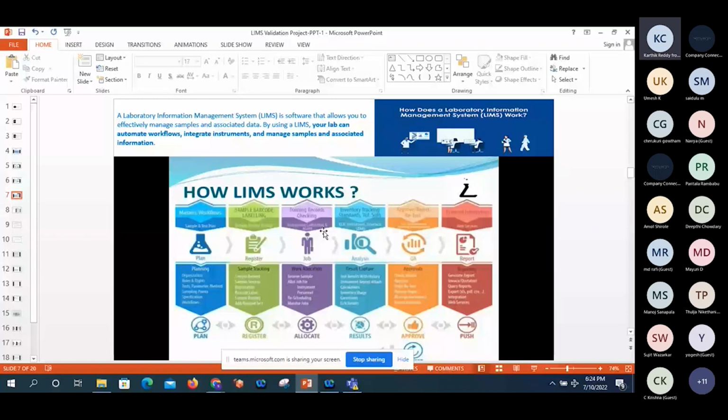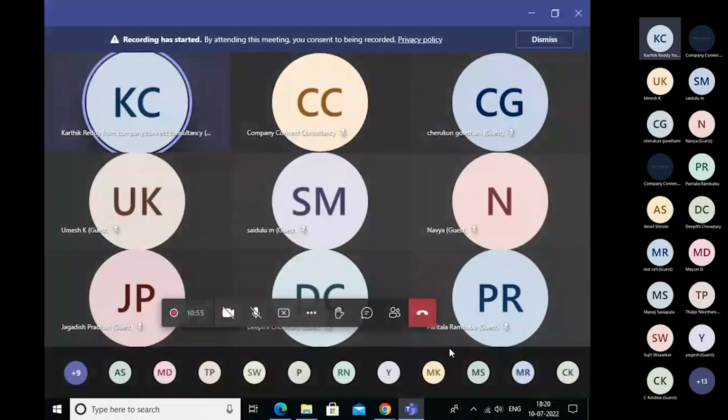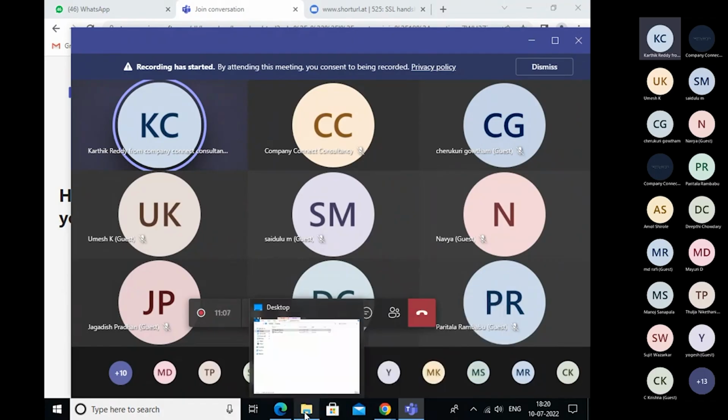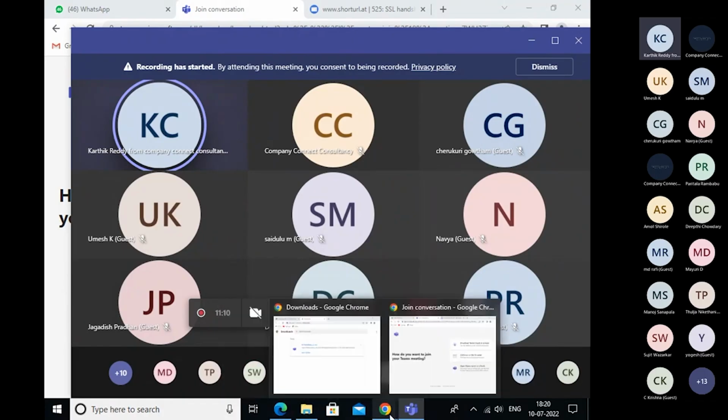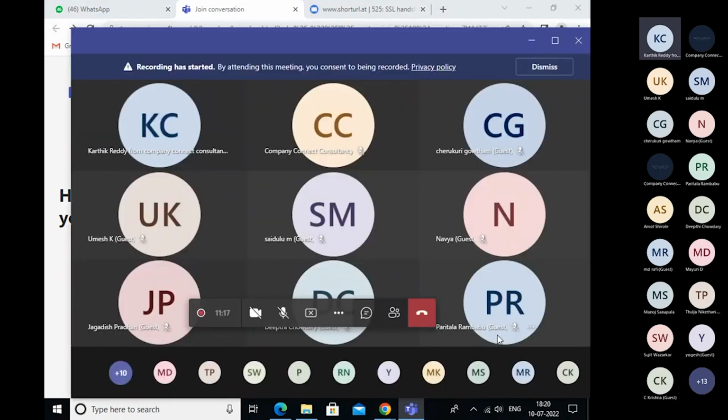After that, there are training records, like how the training records will be checked. There is an analyst qualification module available in LIMS. Whoever completes the training, for example, if I want to learn HPLC, the analyst qualification module has one procedure available for each laboratory, so people can be trained on that. Those details we will import by entering manually in LIMS in the initial phase.